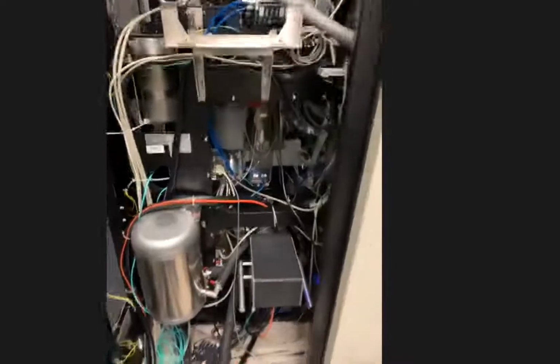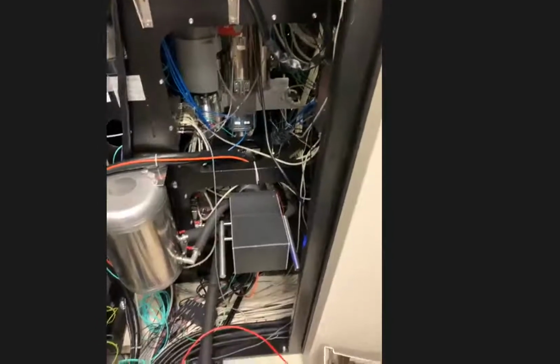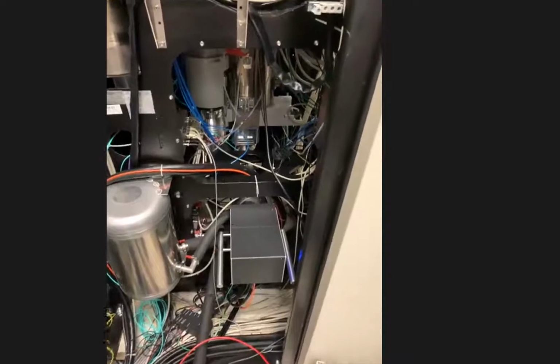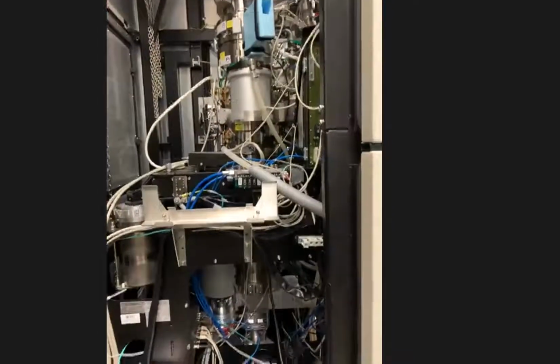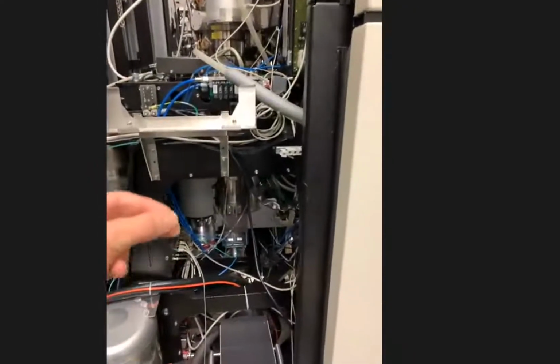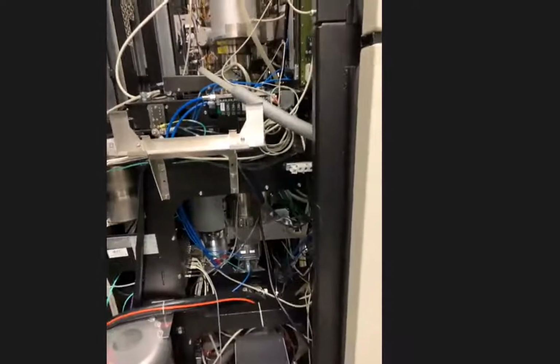And you can actually see that it's at right angles to the main column, and that's because there is a filter that actually bends the electrons when they get to the bottom of the column. It bends it down, it gets rid of the unwanted electrons.